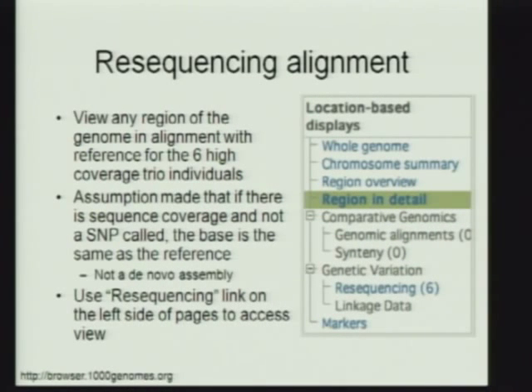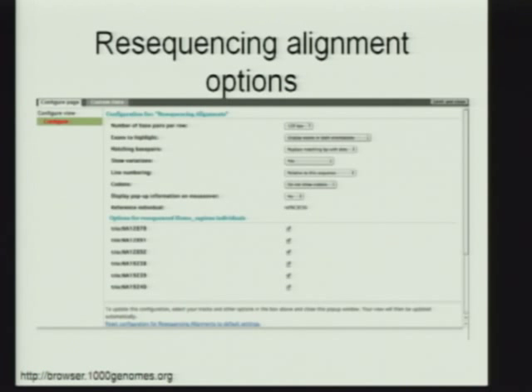I alluded to earlier this concept of resequencing alignment that we provide for the six high-coverage trios. What this allows you to do is view any region of the reference genome with the SNPs from the six high-coverage individuals substituted in. This is not a de novo assembly of these individuals — it's a view of the reference genome with the SNPs from these high-coverage individuals substituted in. We also mark the areas where there's no coverage — that 15 percent of the genome that Gabor talked about that we can't see into. This is configured via the 'Configure This Page' link, allowing you to select which of the trio individuals you'd want to see. This is the only place we provide individual sequence data for samples in the project via the browser; everything else is either the entire trio track or the population tracks.